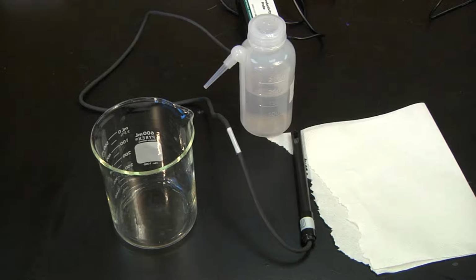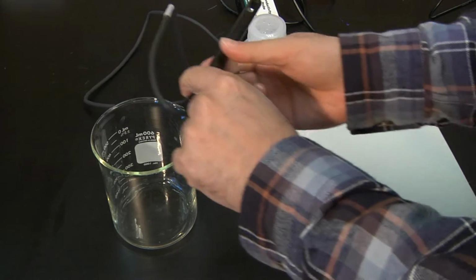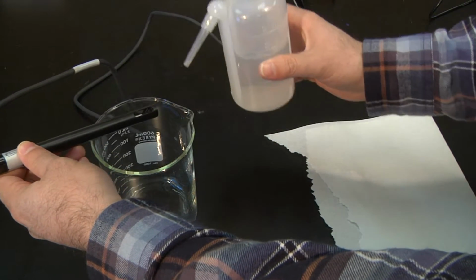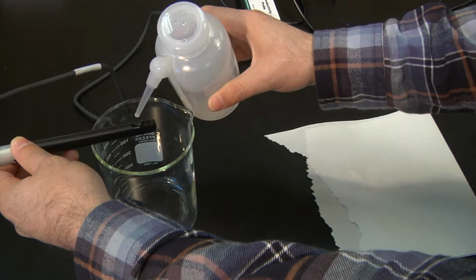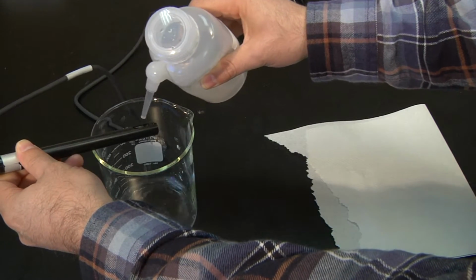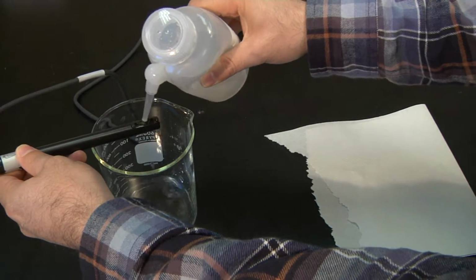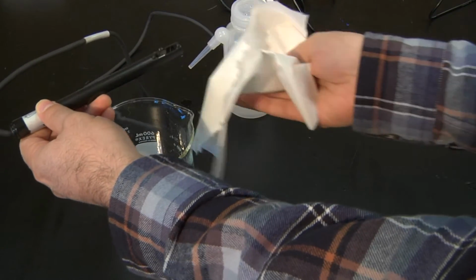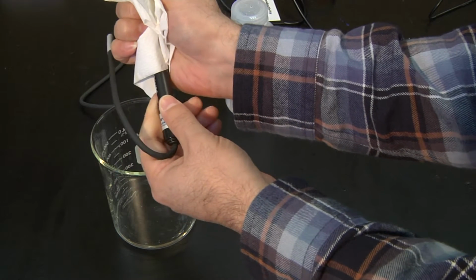After you connect your conductivity sensor to the computer, clean the sensor using distilled water from the wash bottle into a waste container. And then blot it dry using a piece of paper towel.